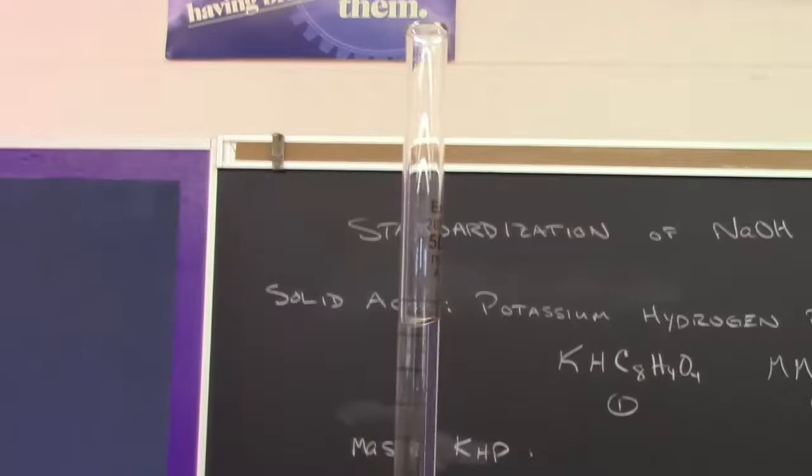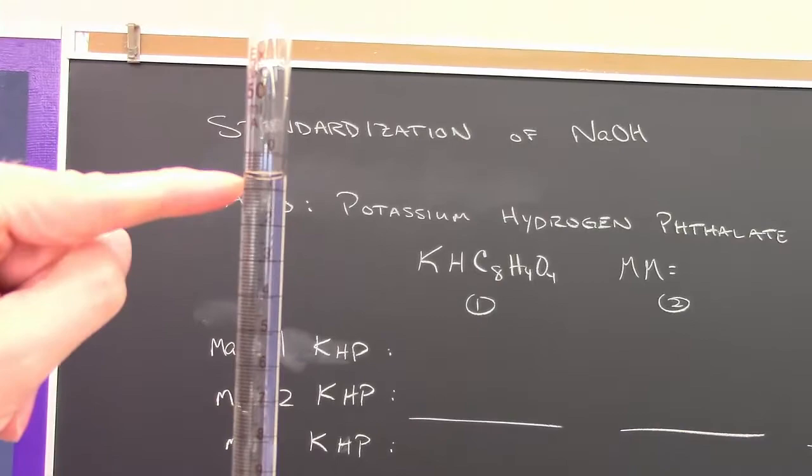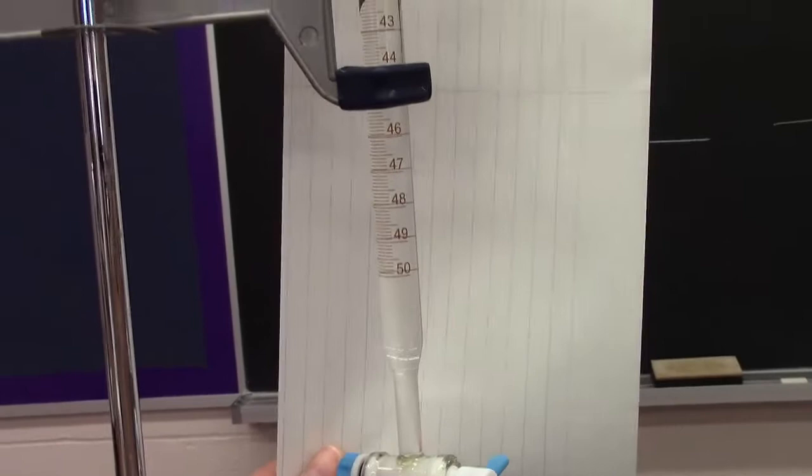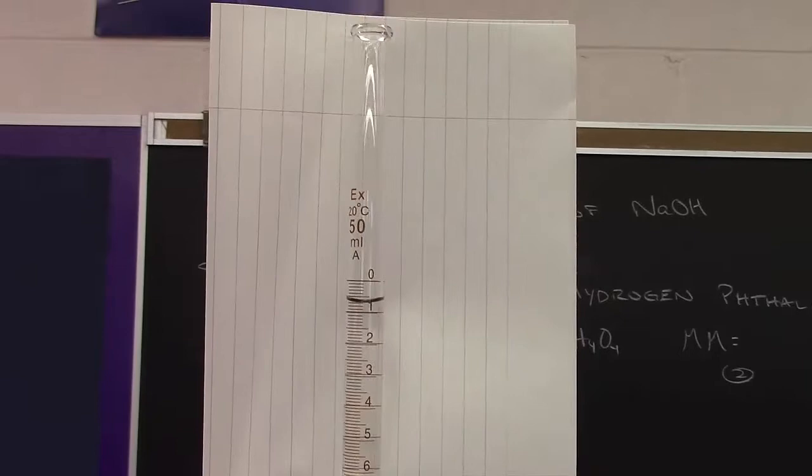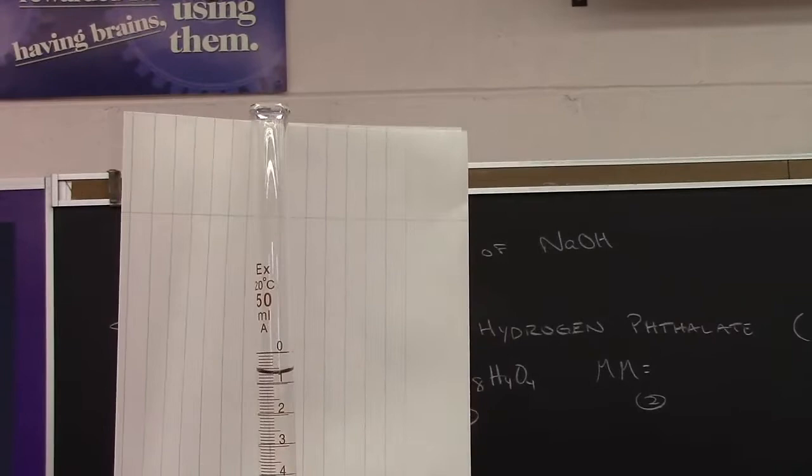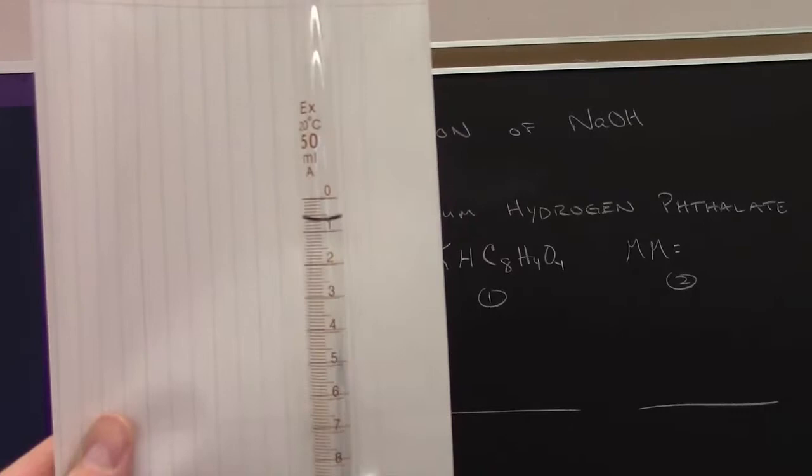One of the things that's interesting about a burette is that the zero volume marker is at the top, and at the bottom there will be a 50. The reason for that is the burette does not measure how much is in the burette, it measures how much I've put out of the burette. At the bottom is this valve assembly.